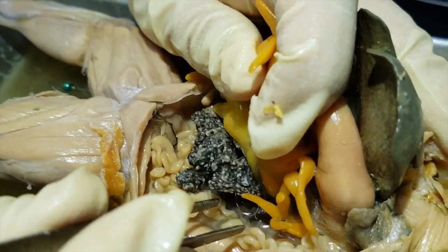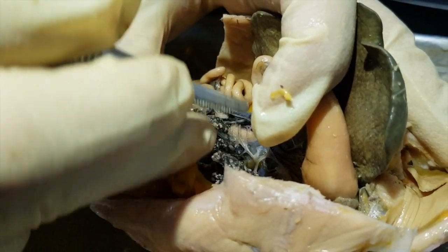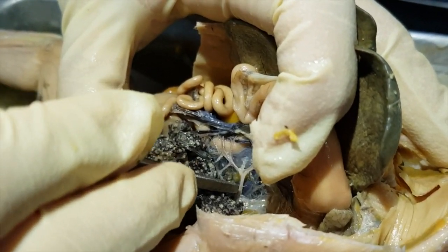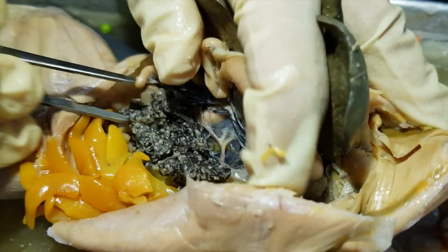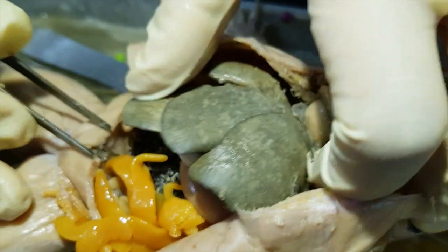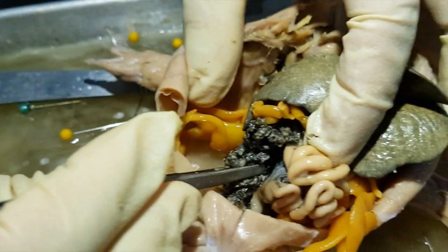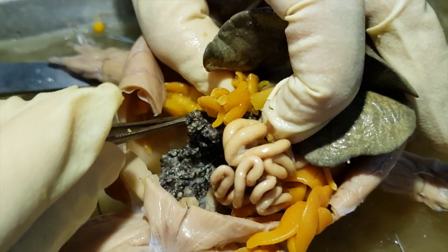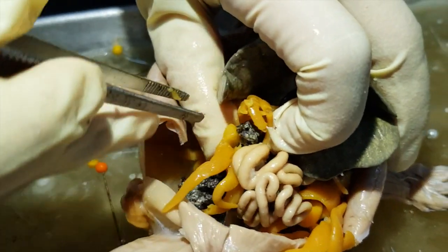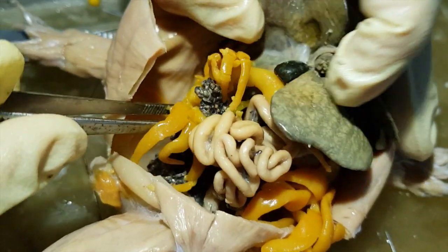In male frogs, these are not present, but instead you will see a yellowish paired structure located here, and that would be the testis. Then on the other side you'll see the eggs from the ovary, then they travel to this coiled structure, the oviduct. These are fat bodies.